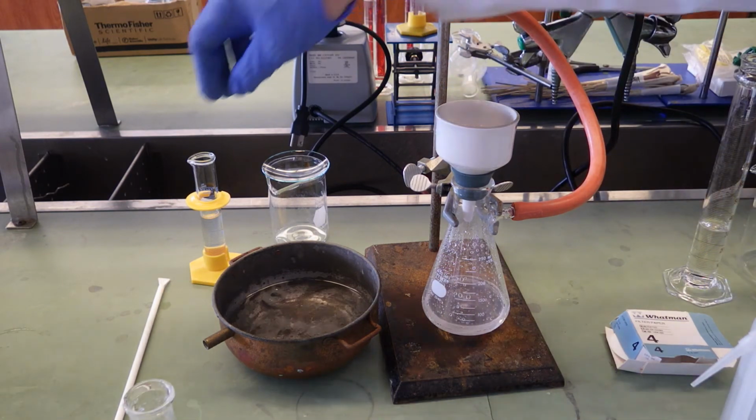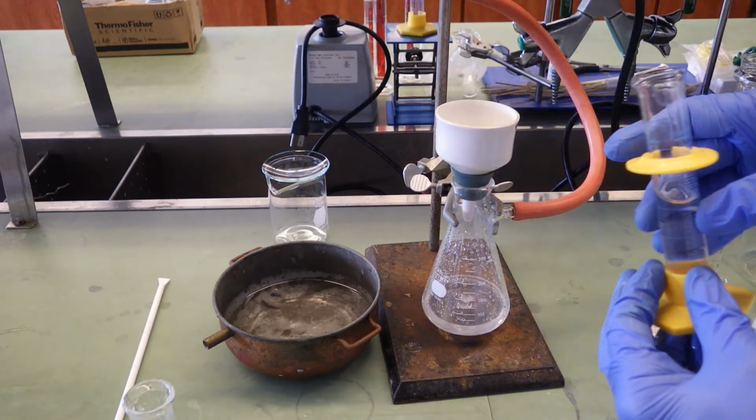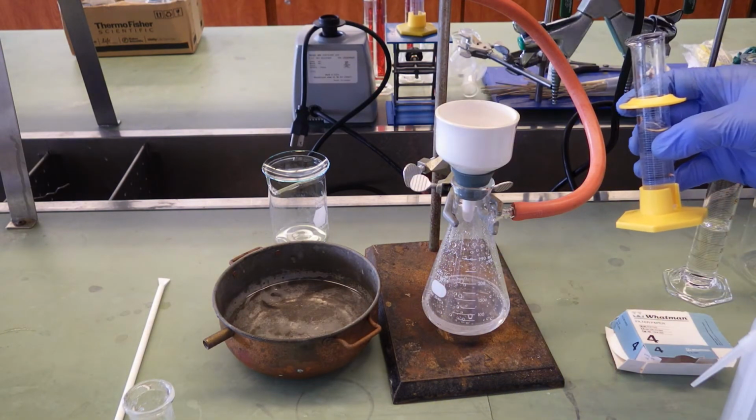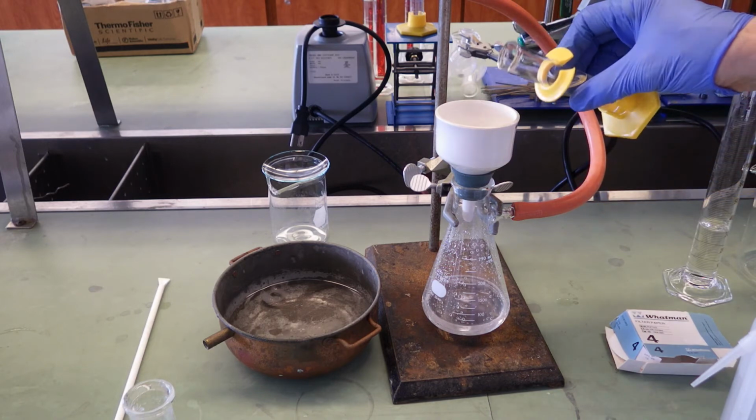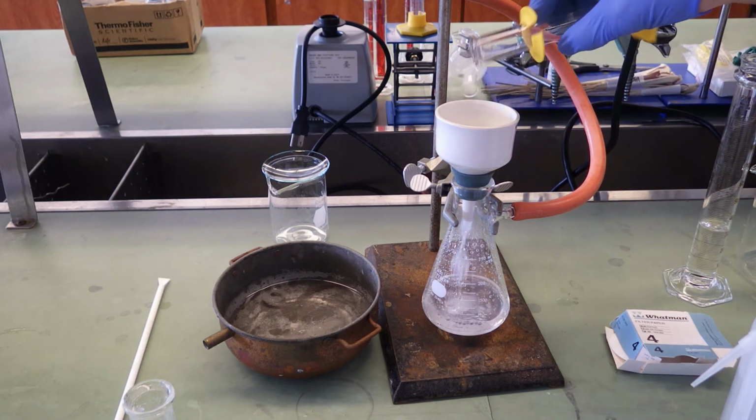We're trying to wash out the residual acetic acid here. This is 20 mils of cold water. We will lose some ASA in the process because it has some solubility, but that is the cost of purification.